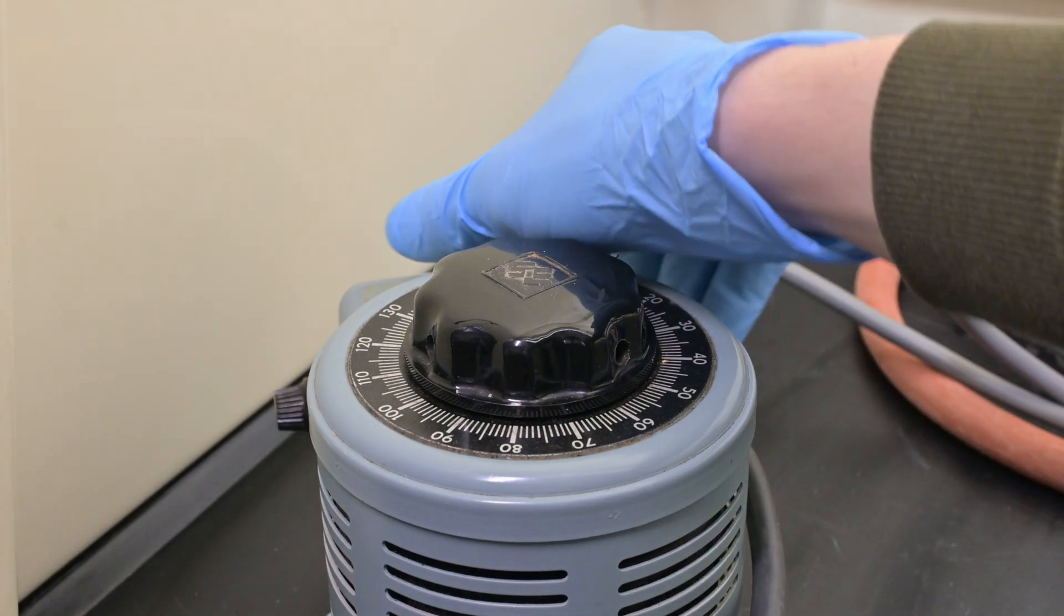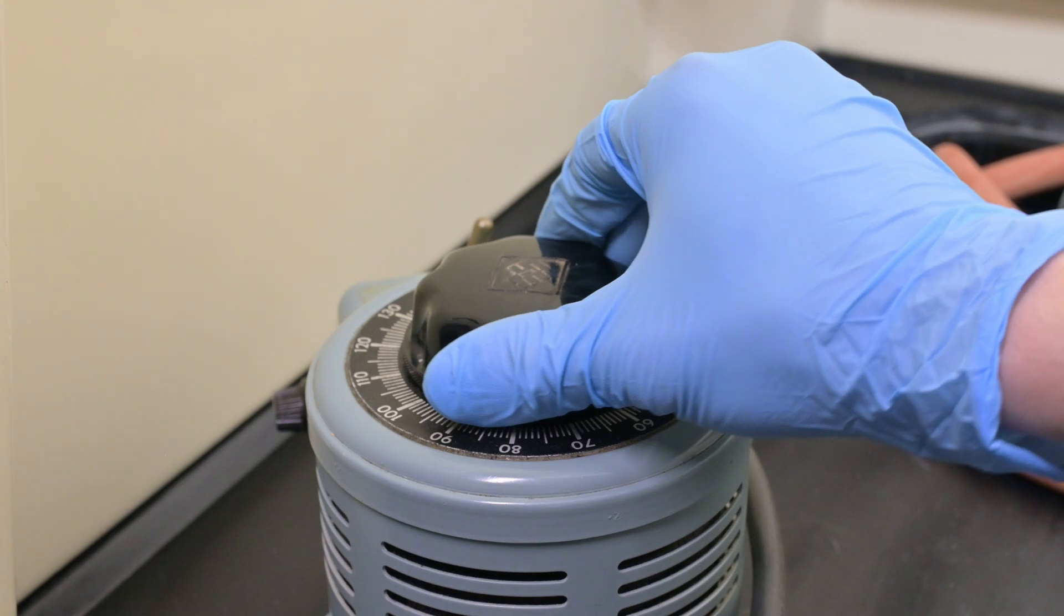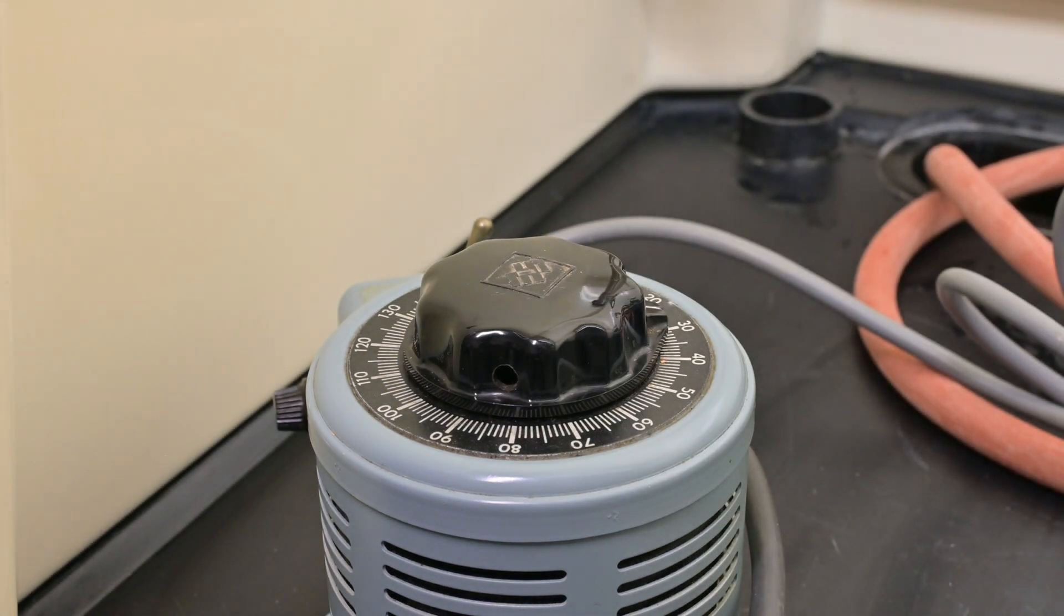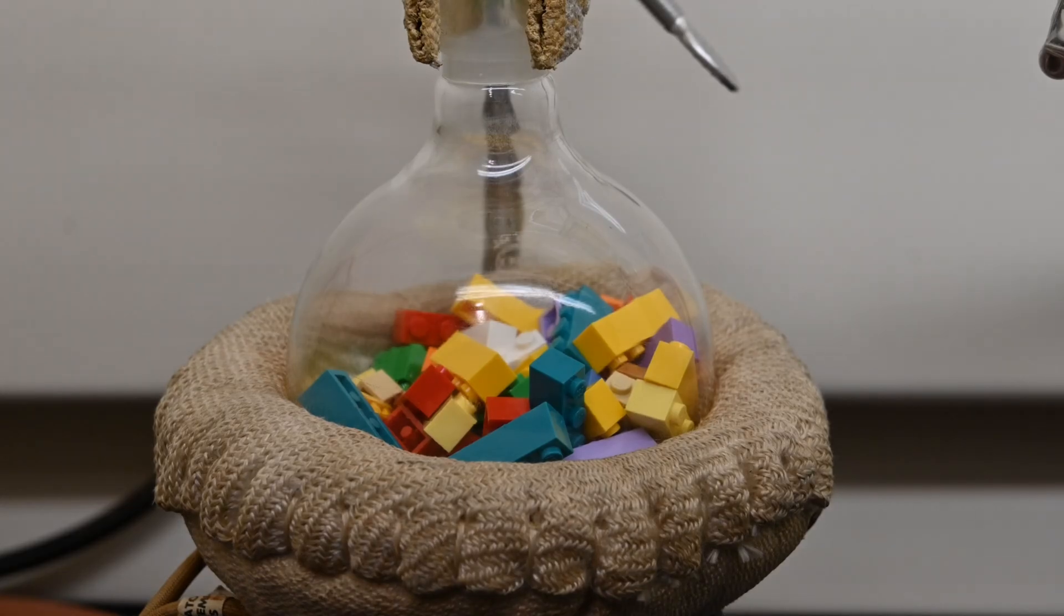After purging the system with nitrogen, we began to heat the flask slowly, starting at a low temperature and gradually ramping it up. Around 100 degrees celsius, we started to see water evaporating and collecting at the top of the flask.